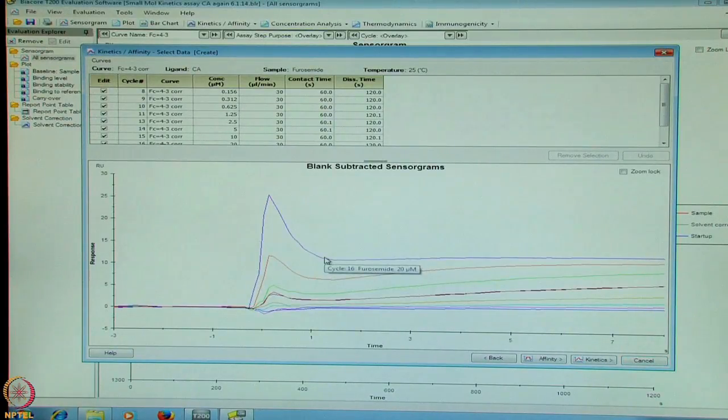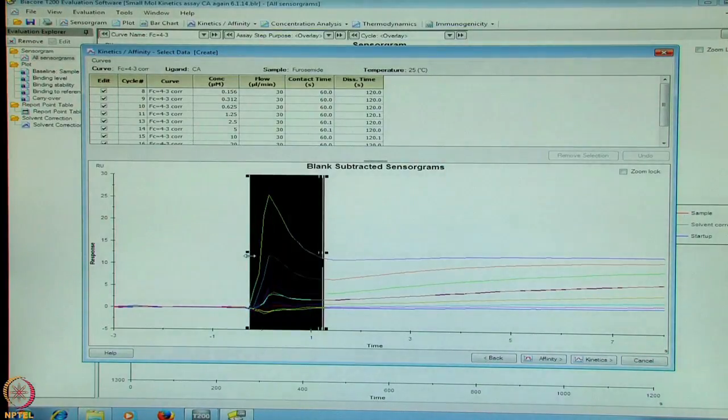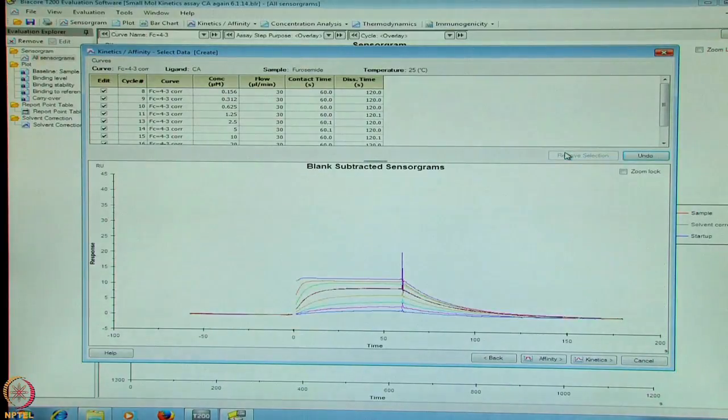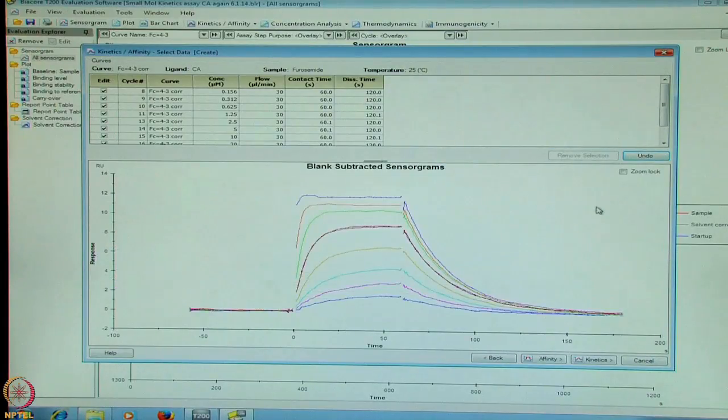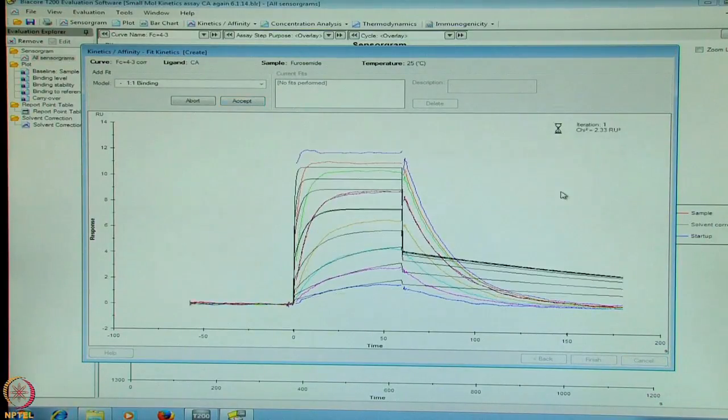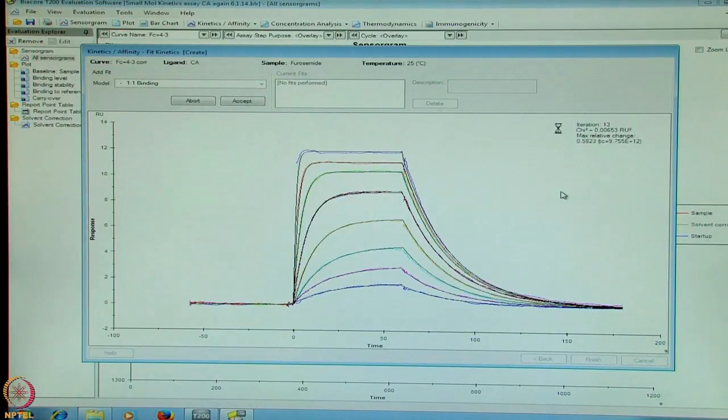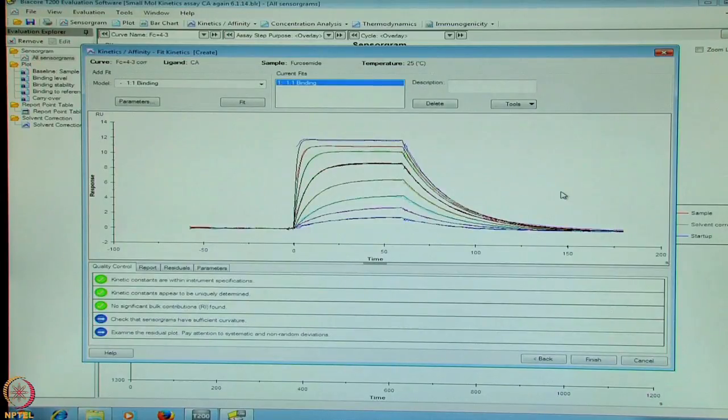We say next and we can clearly see the data having some spikes. So using the mouse button, we can highlight that range, subtract or remove the selected areas. Similarly, we can do that here as well. Once the subtraction is done, we can go further to evaluate in the kinetic mode and fit the data. So here on the quality control tab, you see all of them green and there is no significant bulk contribution found. And data is uniquely determined. And the data points are the kinetic on and off rates are within the range of the machine.